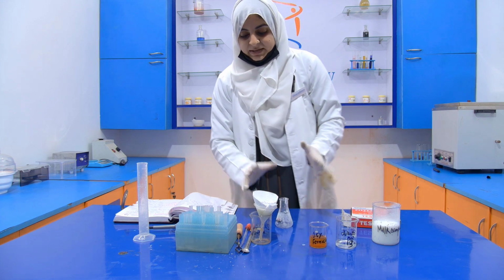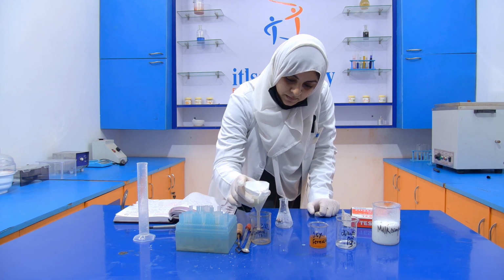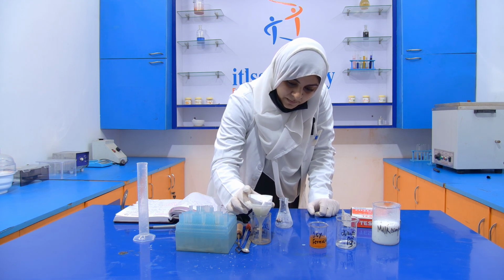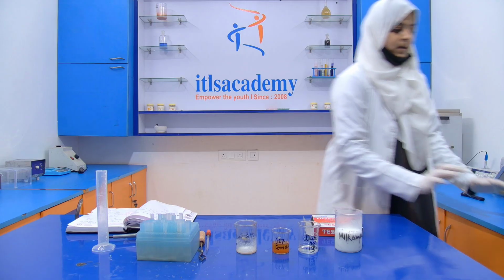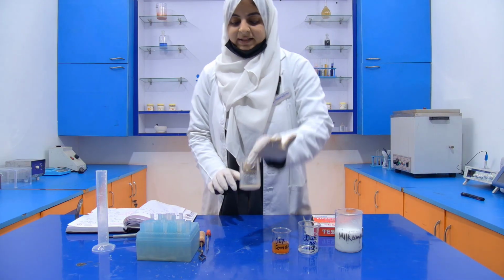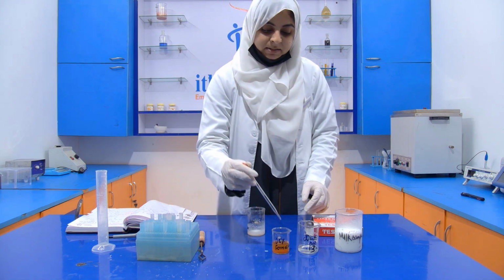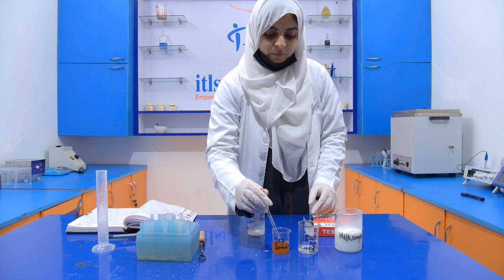Again, it will come very slowly. See that. We have to collect the filtrate. Now after filtration, we collect that filtrate. Into the filtrate, I am going to add this 0.5% ferric chloride, 2 to 3 drops.